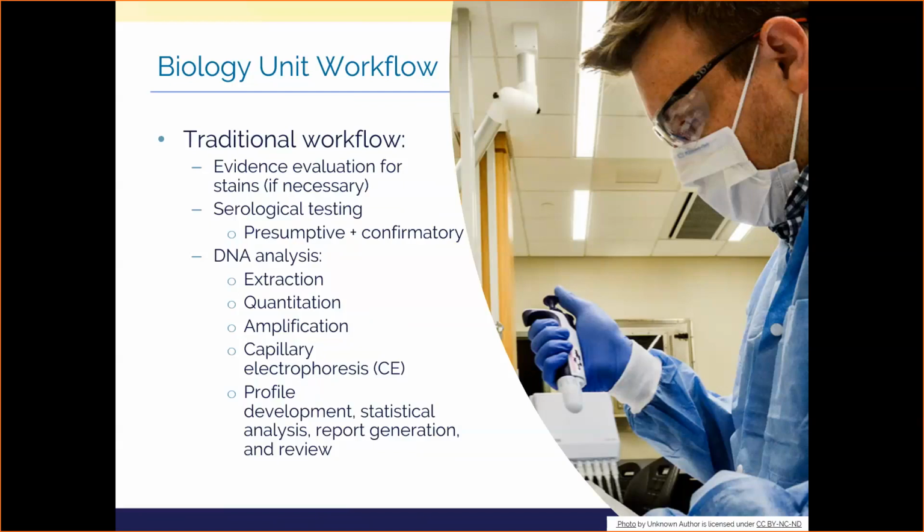As such, each sample goes through this discretionary evaluation by the analyst at the very beginning of its life at the laboratory. We have to determine what tests we can perform and may have to pick and choose the best testing for your items, even if it's not what you ideally wanted. Now, we don't just do this and simply steamroll over your lab requests. A good lab analyst is going to explain their rationale and defend it before they even commit to testing. But I present you with this example so that you understand that we may simply not be able to do everything you ask in the lab, as it could be to the detriment of your case.